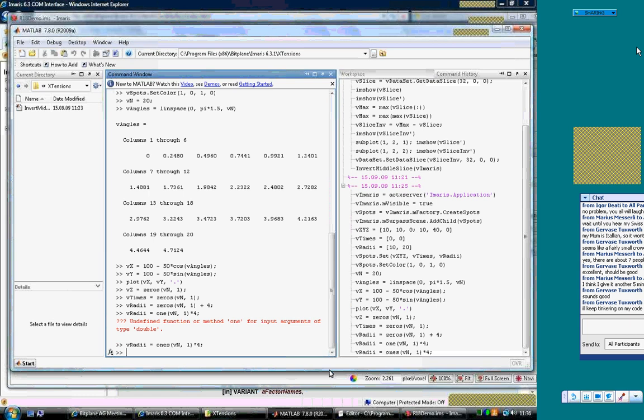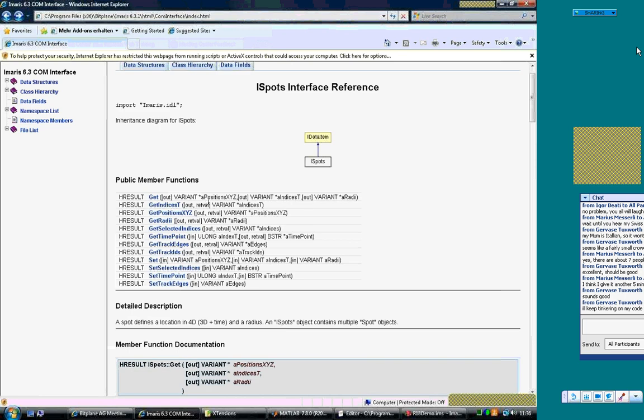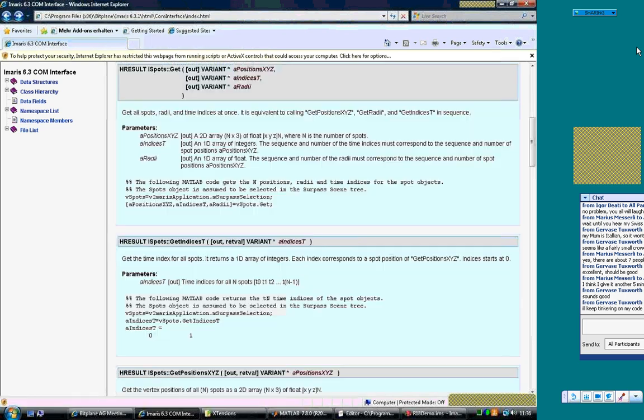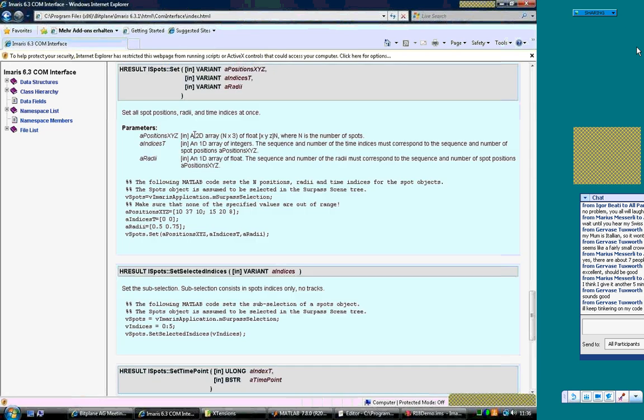Now finally we can set our values, but we have first to generate, here, not get, set, we want to generate this matrix.